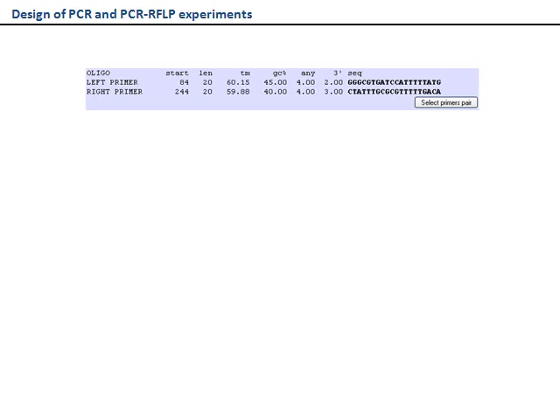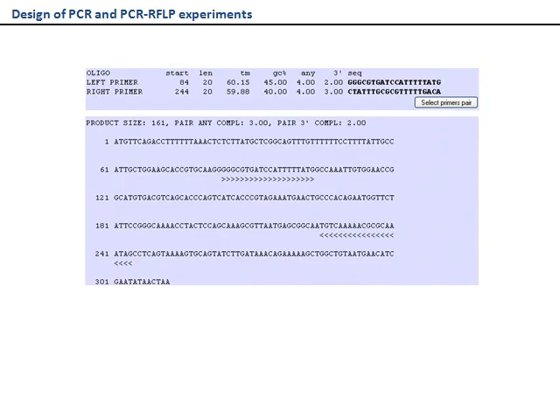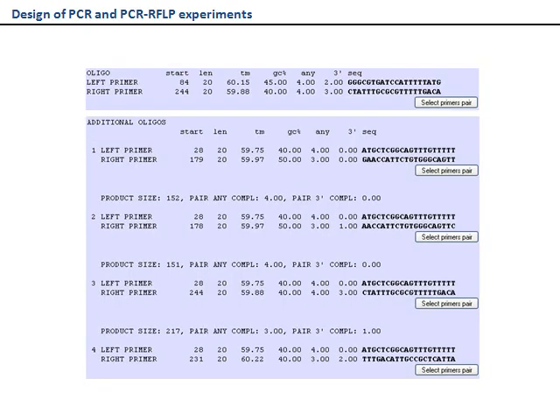For the first pair of primers yielded by Primer3, which is also the first recommendation of the program, the complete DNA sequence, and the position of both primers within the sequence, the forward primer and the reverse primer, are shown. Amplification will generate copies of the sequence between both primers. For the remaining 4 pairs of primers, only the basic information is provided. All it takes to select the pair of primers is a click on one of the buttons. In this case, the first pair of primers will be selected.